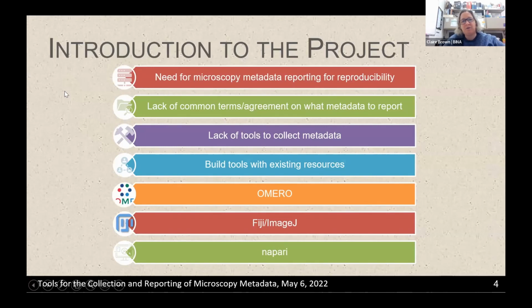Just to give you a bit of an overview of the project, I think you saw we were going to ask how many people had a chance to watch the video ahead of time, or if you had attended the talk this morning, and maybe we can just do it by a show of hands or thumbs up on the reactions. Maybe you can look, Caterina, because I can't see with my sharing on. Tao, do you need to ask a question, or you're just saying that you watched it? I think they're just saying they watched it, but yeah. So just a few of you, okay.